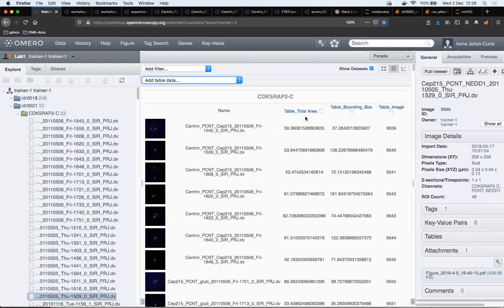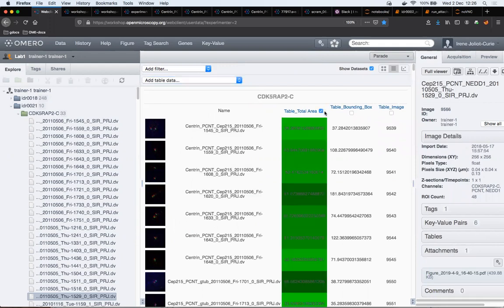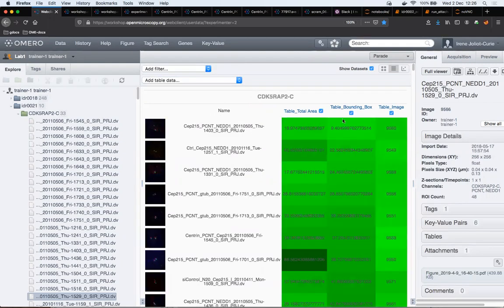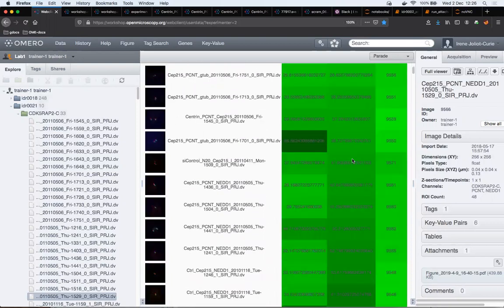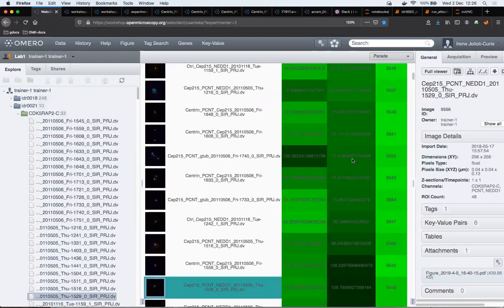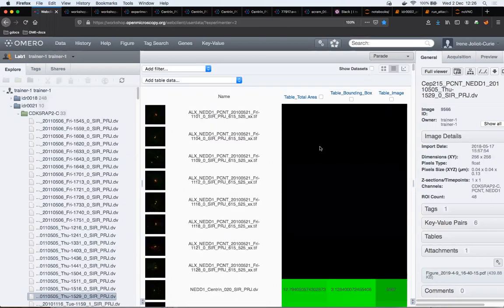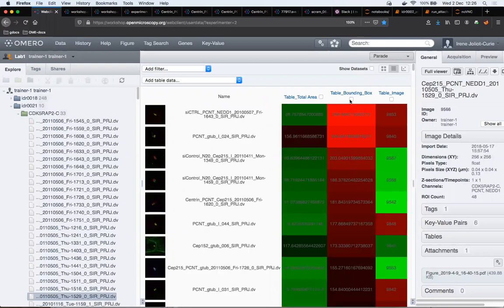Having these three columns like so, I can now check the checkbox, which will simply switch on the color coding on the rows, and I can do it for all three and sort the data according to the value in this column. And I can do it per dataset, or I can do it for all. These images have simply no values in the CSV.